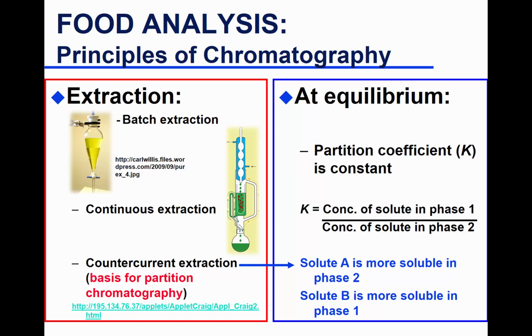So once the solvent is heated, it will evaporate, reaches the top, cold water is running, it condenses over the sample, solubilizes, in this case your fat, and then gets siphoned back into here. At the end of the extraction, it's continuous because it continuously goes up and down, and more pure solvent gets evaporated, gets into your sample, extracts more fat, and goes down. So what happens at the end, you'll have your fat and the solvent here, and you have a defatted sample up here.